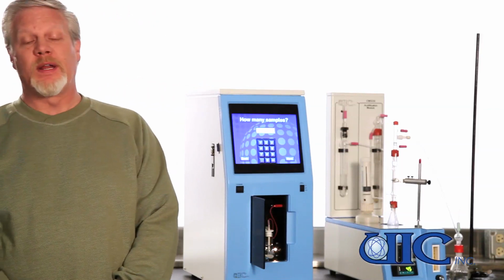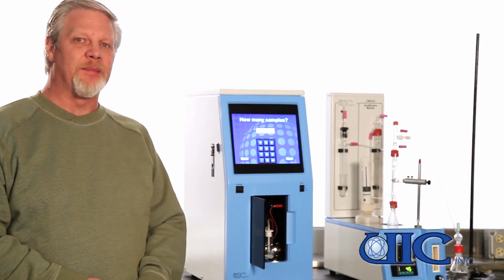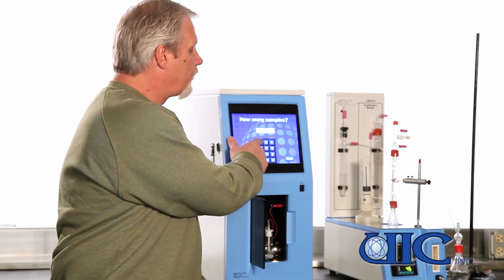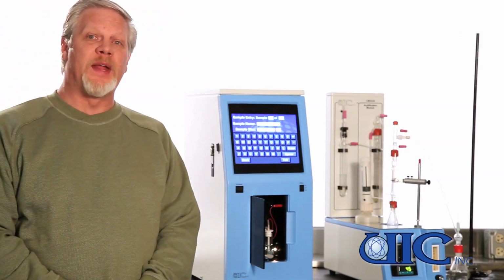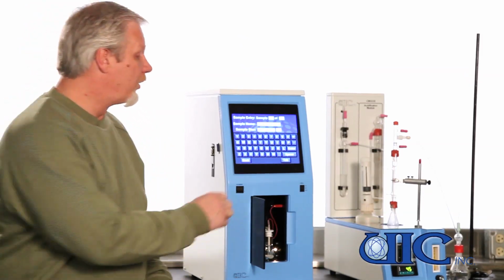And that'll bring us, it'll ask us how many samples we want to run. In general, we'll just run one sample at a time. At the end of each sample, it'll ask us if we want to run another. So we'll select one here and hit next. Here we'll enter our sample names and sample sizes. For a blank, we just enter the word blank.